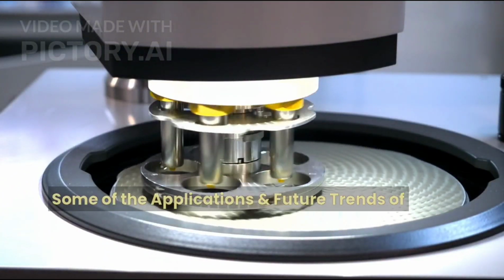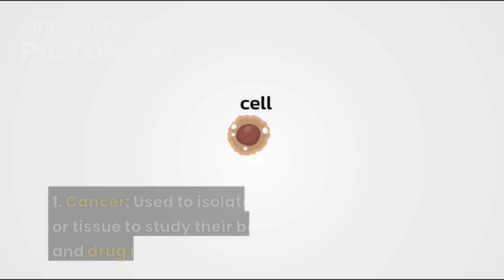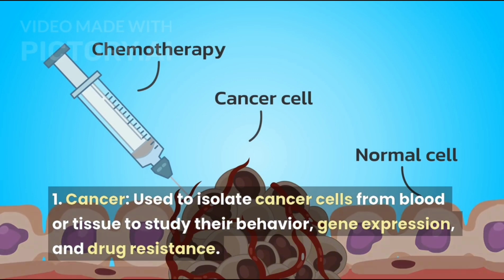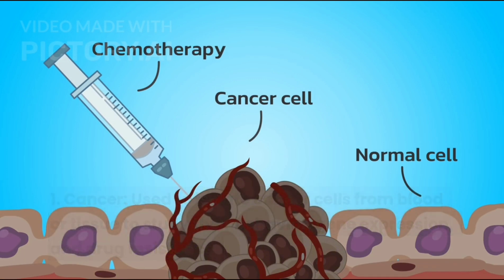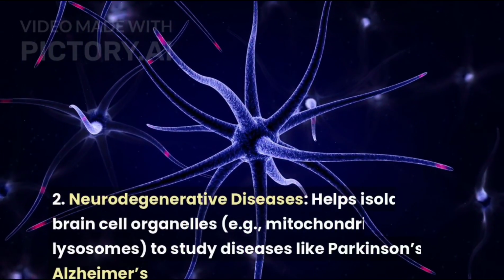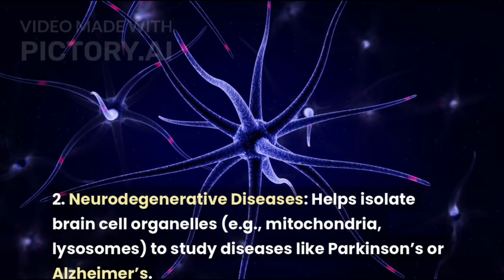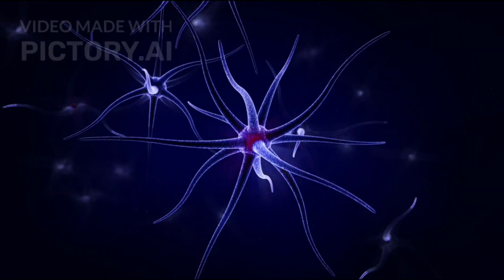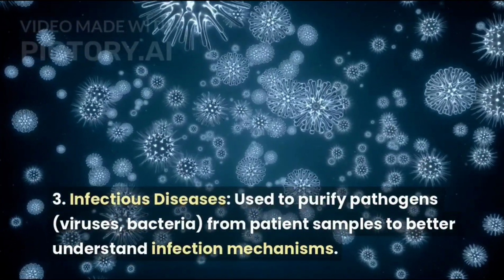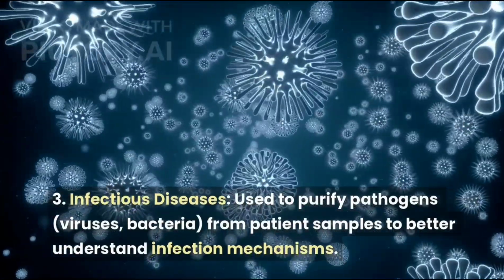Some of the applications and future trends of centrifugation in disease research are: Number 1, cancer, used to isolate cancer cells from blood or tissue to study their behavior, gene expression, and drug resistance. Number 2, neurodegenerative diseases, helps isolate brain cell organelles, for example, mitochondria, lysosomes, to study diseases like Parkinson's or Alzheimer's. Number 3, infectious diseases, used to purify pathogens, virus, bacteria from patient samples to better understand infection mechanisms.